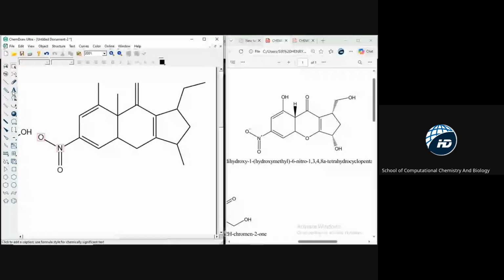So I come to this place. I put my OH. This is my O. This is my H. My OH, and then my stereo bonds. I have a stereo bond here. I have a wedge bond here. I have a wedge bond here. And I have a wedge bond here.